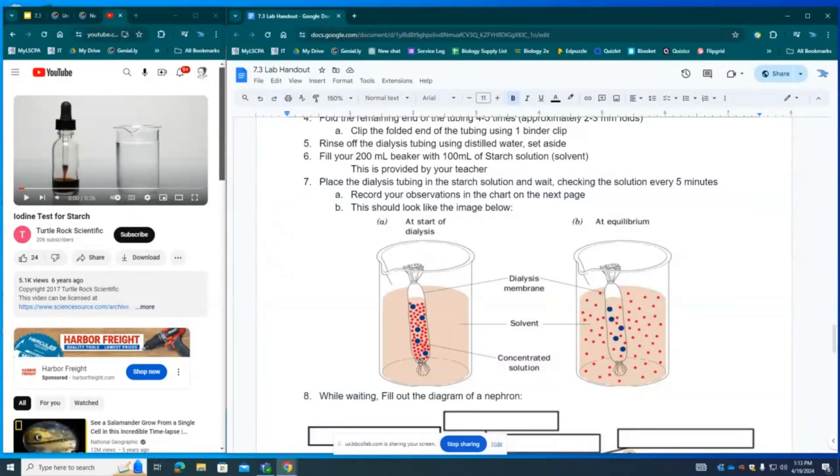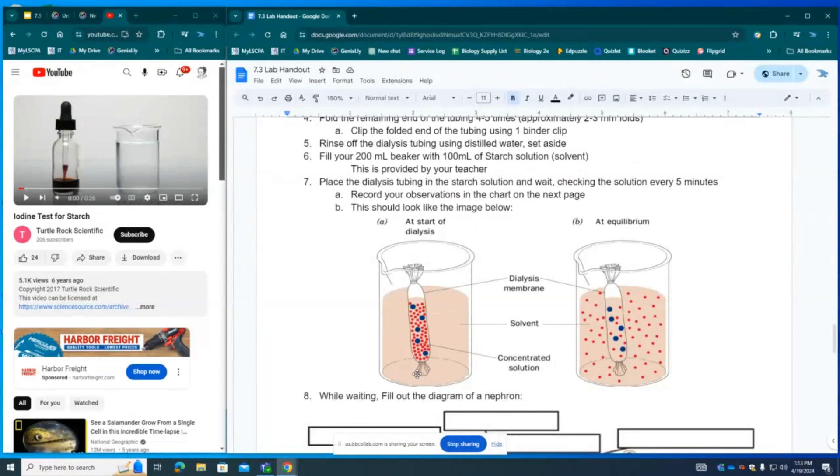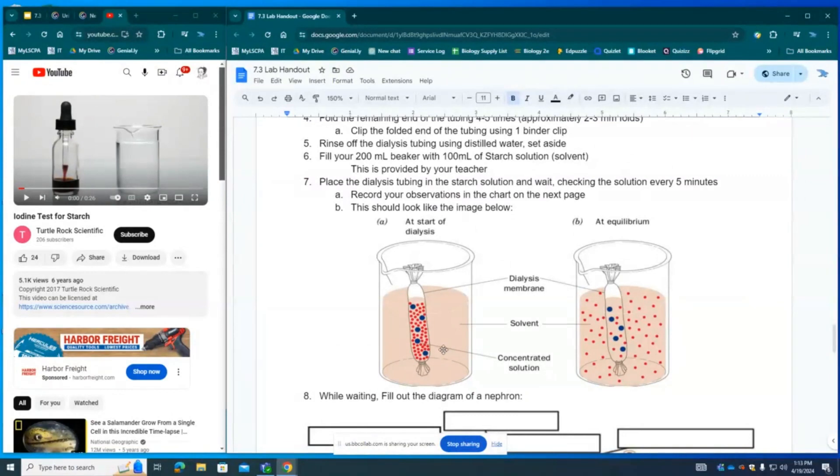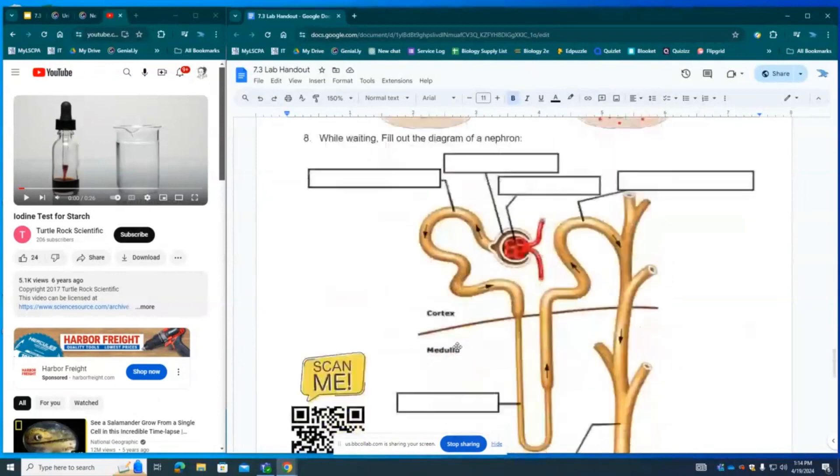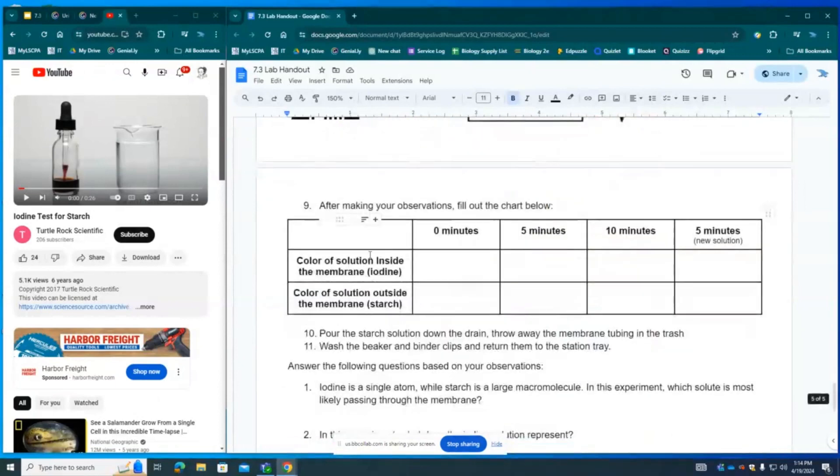Inside of the dialysis membrane, we will be filling this tube with iodine or an iodine solution, watered down iodine. Outside of the semi-permeable membrane is a starch solution. I want you to be thinking about what these two solutions might represent. As soon as we set up the experiment, we need to make some observations and fill them out on the chart here.